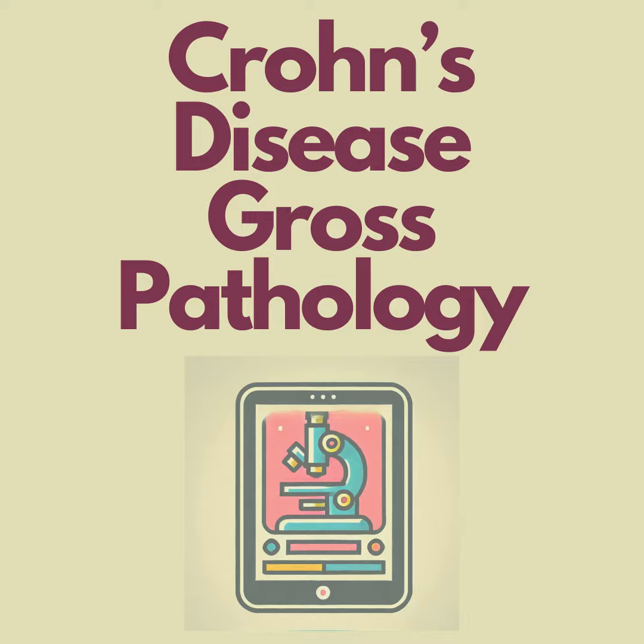Exactly. What about lymph nodes? Why are those important in a colectomy specimen? They can help us stage any cancers that might be present. Okay, so we're looking for both inflammation and malignancy in those lymph nodes. Exactly. Well, it sounds like we've got our work cut out for us with this specimen.